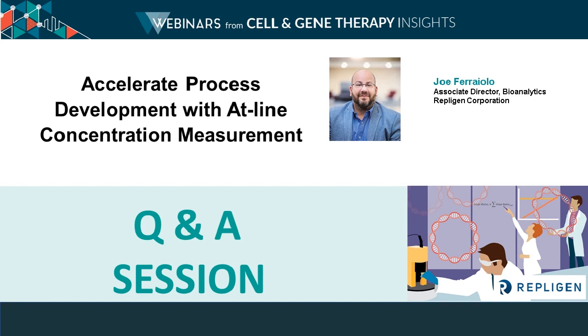Okay, good to know. And are there any applications for CAR T processes of this technology? Currently, not yet. I would say it's something we're not focused on short term. I can tell you that if your current method is a UV-based one, then yes, you can certainly apply slope spectroscopy to that, but our current focus is not at that step yet.